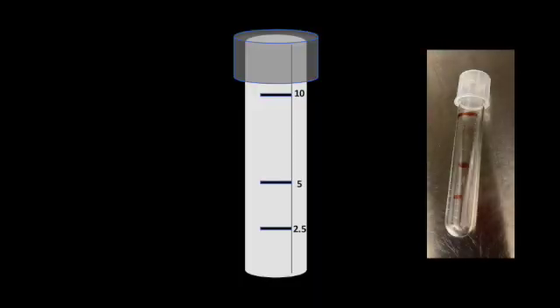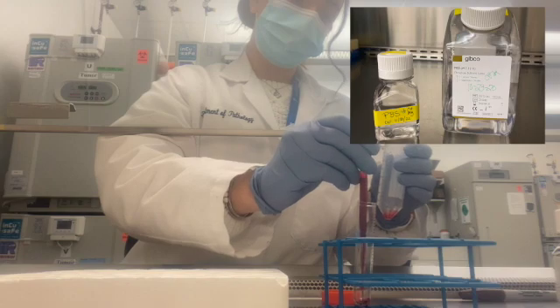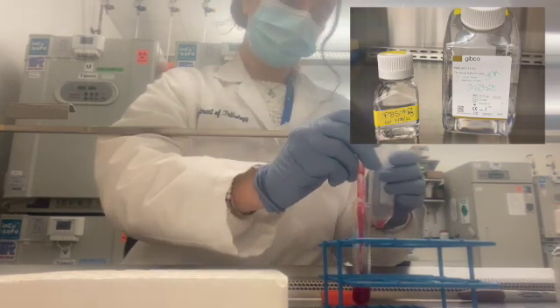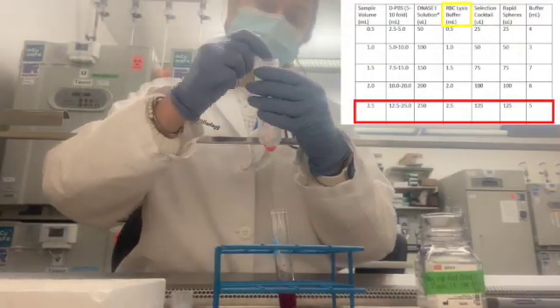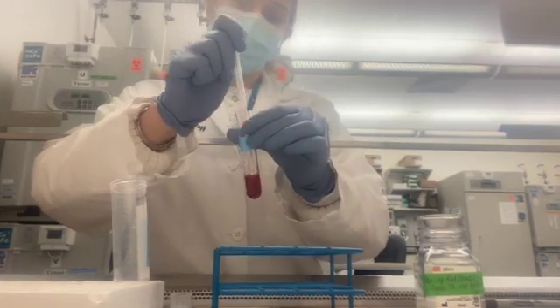Label a 14 ml tube. It's also helpful to write small lines with a sharpie on the tube at 10 milliliters, the original sample volume, and double the sample volume. Transfer your sample into the 14 ml tube. If it's less than the original volume, you can resuspend it with DPBS, rinsing out the prior tube. Next, add equal parts EasySep red blood cell lysis buffer to the 14 ml tube with your sample. You can use the buffer to rinse out the 50 ml tube if you didn't in the prior step.